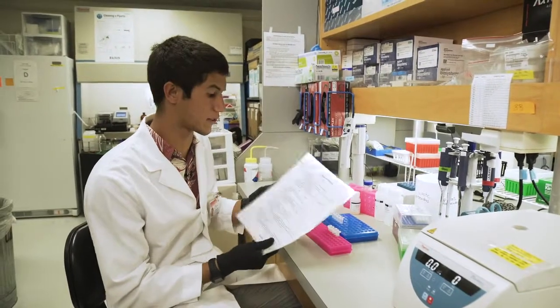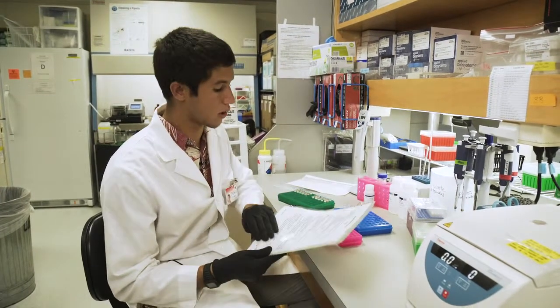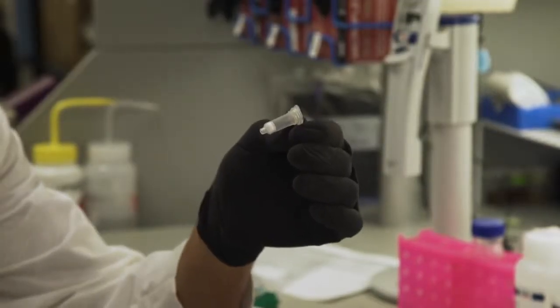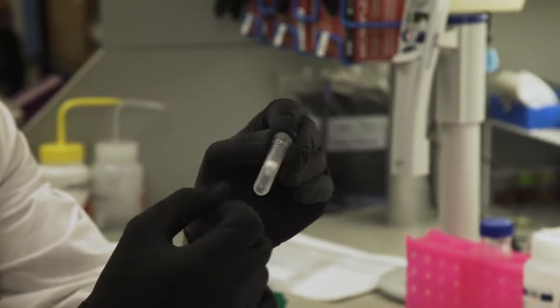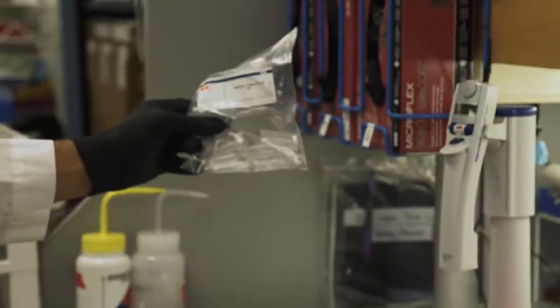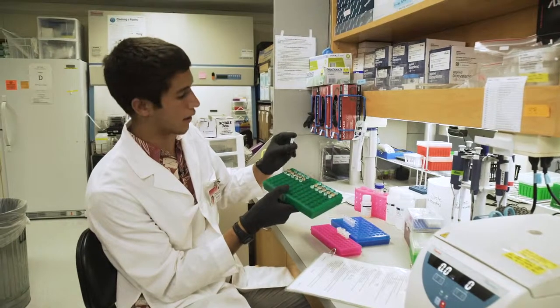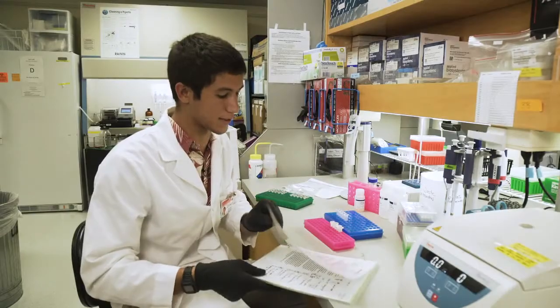To do that, we have this nice protocol here, and it involves washing, is the term we use, washing the tubes and filtering them in these little miniature filter columns. The filter columns are two parts: one, the actual filter, and then the collection tube. And this will be our final clean one. And then at the very end, we'll have them placed into their individual labeled DNA tubes. So this will be only pure DNA once it's in here. Go ahead and get started.